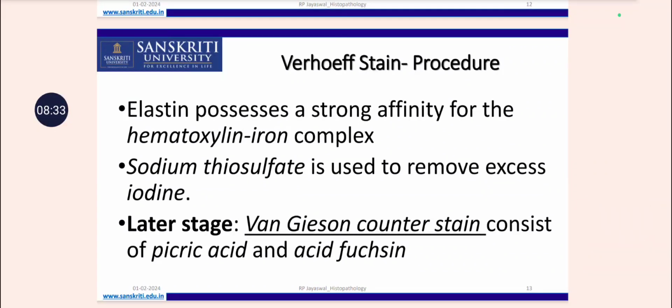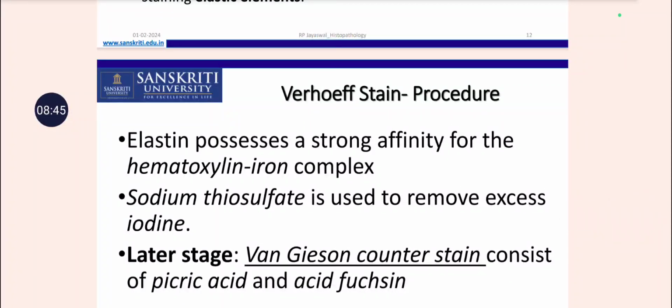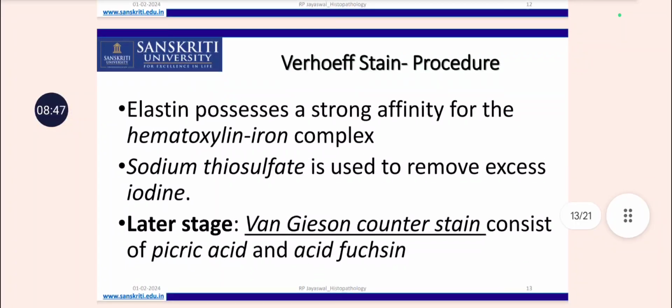Elastin basically has a strong affinity for the hematoxylin iron complex, and sodium thiosulfate here is used to remove excess iodine. Now if the tissue sample has iodine coloration, the extra iodine color can be removed with the help of sodium thiosulfate.